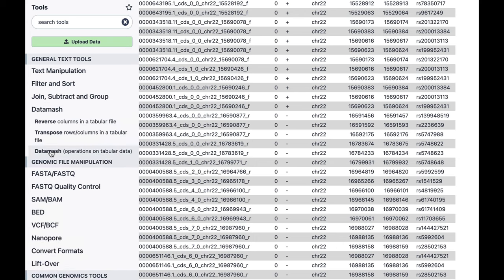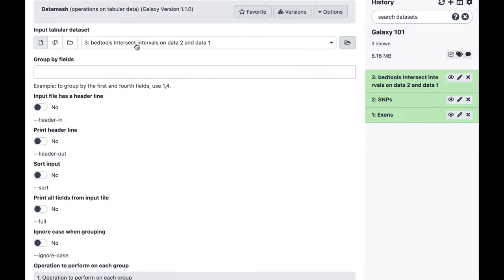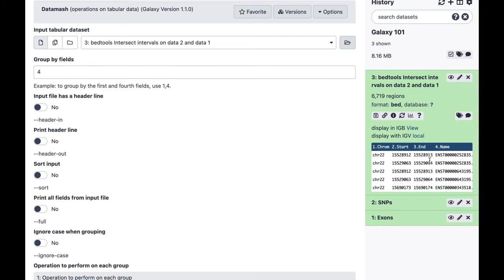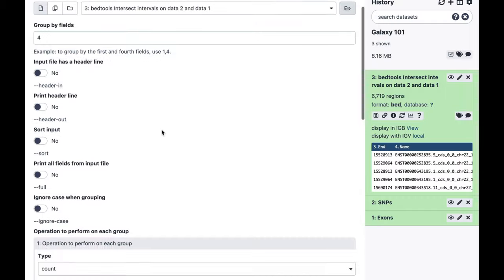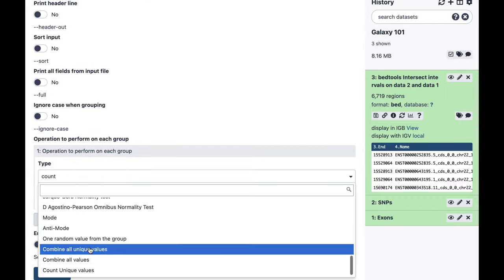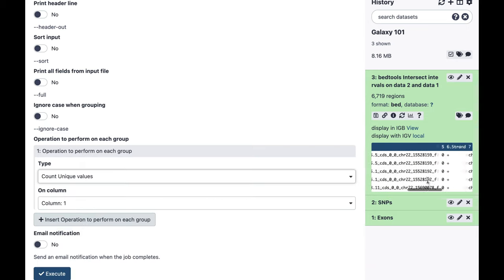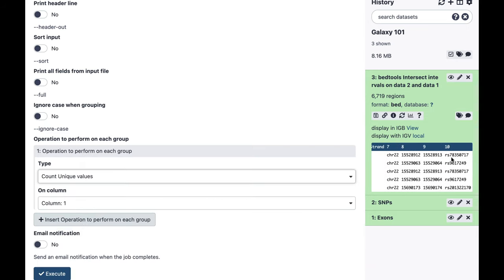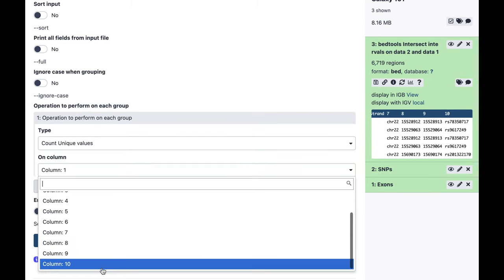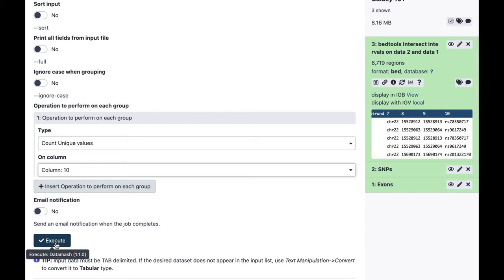We have a great tool for that purpose called Datamash — it meshes data. The dataset we want to run this on is the output of our intersect. We want to group by field four, because that's where our exon ID is. The operation we're going to perform is 'count unique values' in column 10, because column 10 contains snip IDs. Let's run it and see what happens.